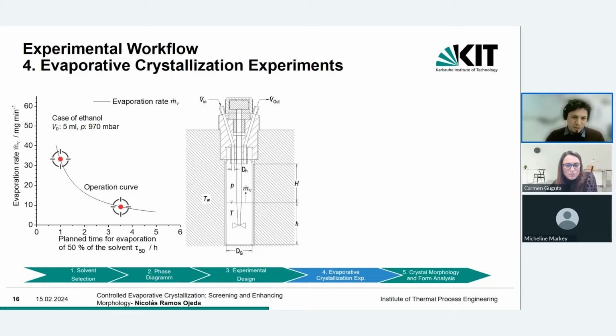And then at the moment that it nucleates, it will nucleate faster because you are driving the supersaturation faster in comparison to the other case. So it will be dynamic. The supersaturation will ascend faster in comparison to the other case.